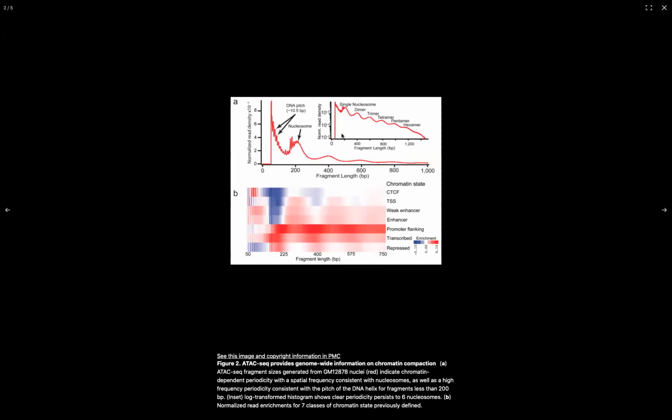Oh, there you go. So kind of messy, but 1, 2, 3, 4. We see 1, 2, 3. Remember, theirs looks a little cleaner because they're using every chromosome. We're just looking at one of the smallest chromosomes.